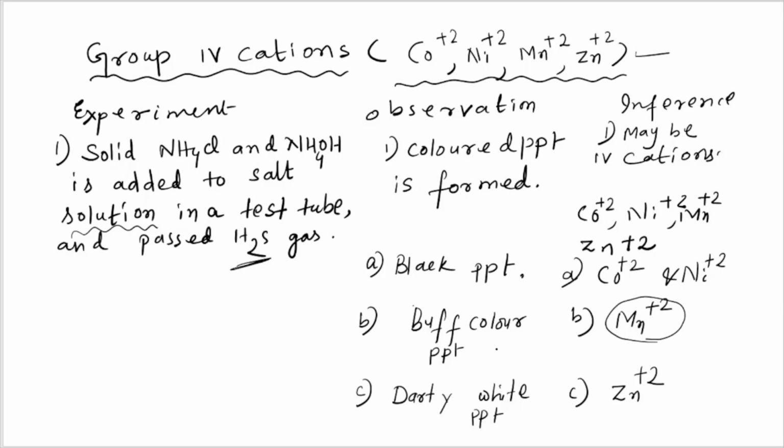Buff color is more blackish or greyish than zinc. Zinc is dirty white color.